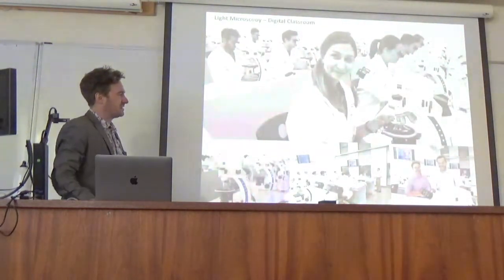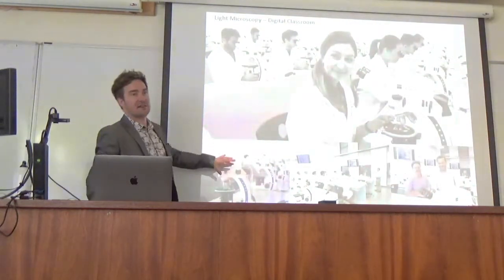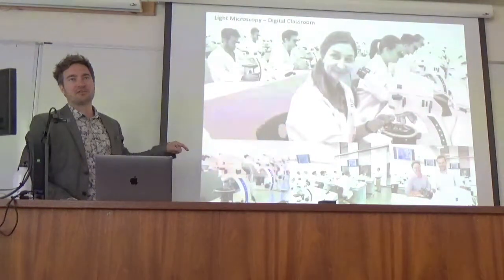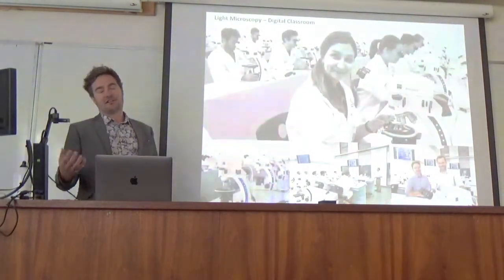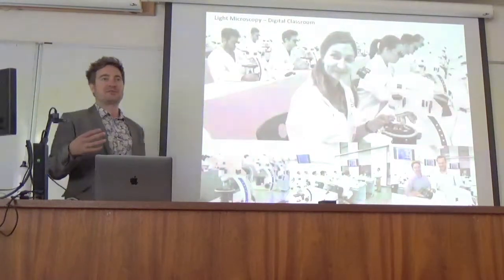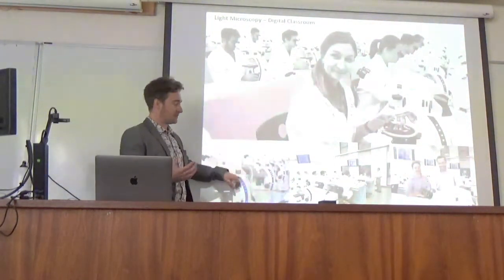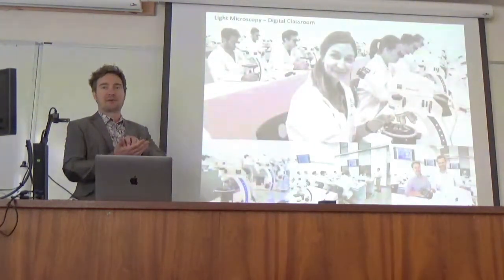This is a bit of a glossy slide that was used in a brochure, but effectively, this is our digital classroom. So each one of these light microscopes is connected. And so the students in the undergraduate courses can save so many images, more than they could in the past. So it's good to have this connected microscopy suite, which is quite rare. It's good for teaching because any student can pull up on the iPad the view down the microscope of anyone else's microscope in that lab.